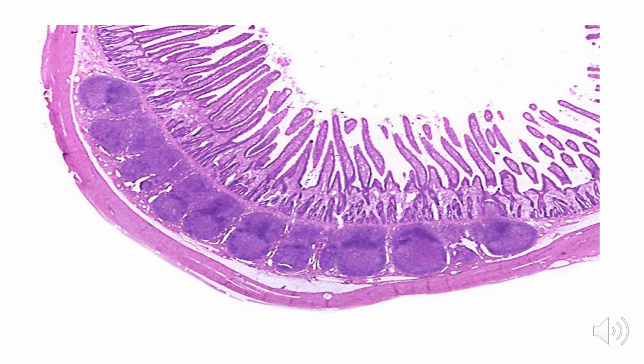This is another picture of the ileum. Please appreciate the presence of villi and crypts of Lieberkühn, and take a look at the arrangement of the lymphocytes in the Peyer's patches. They are in nodular pattern.